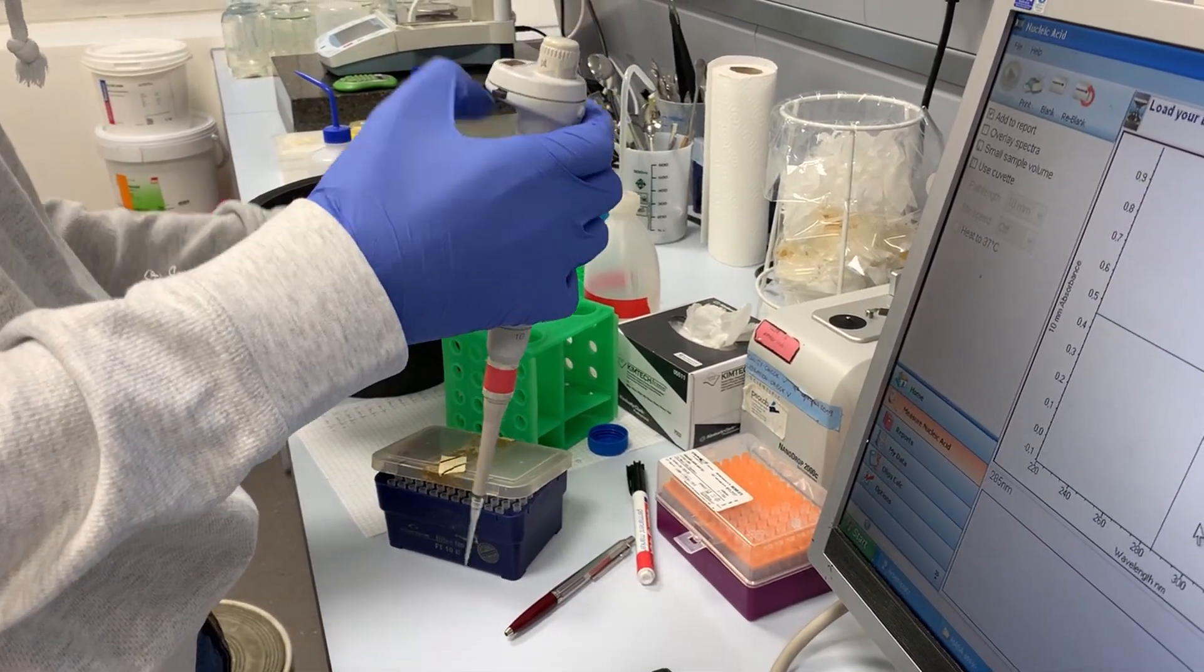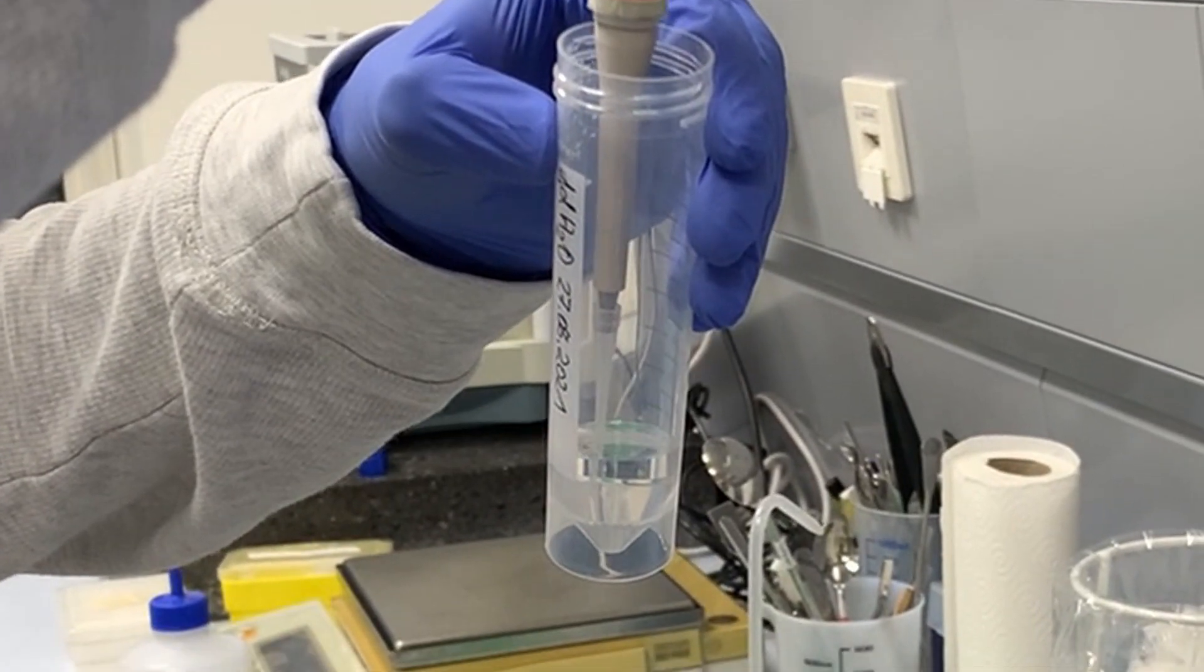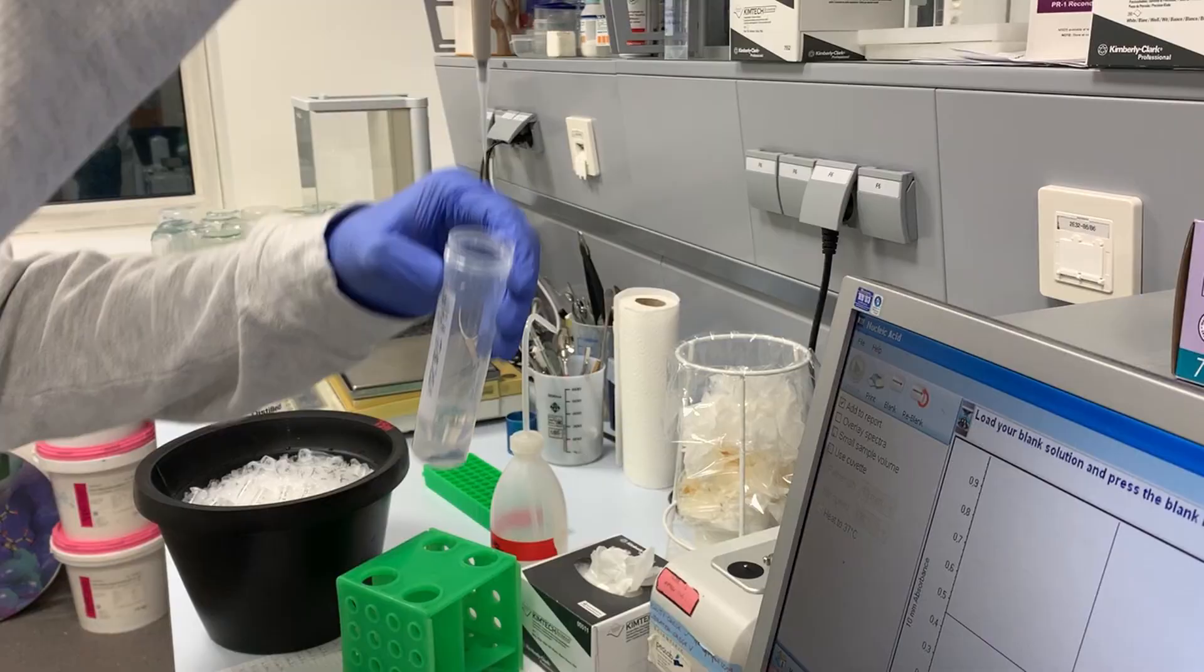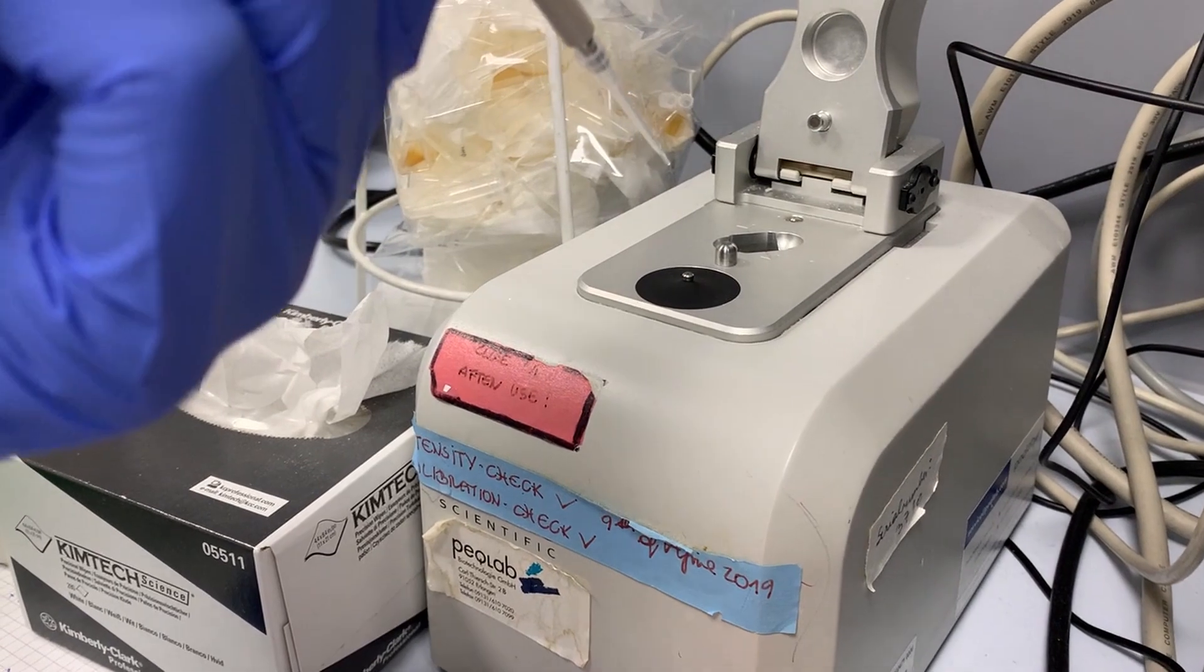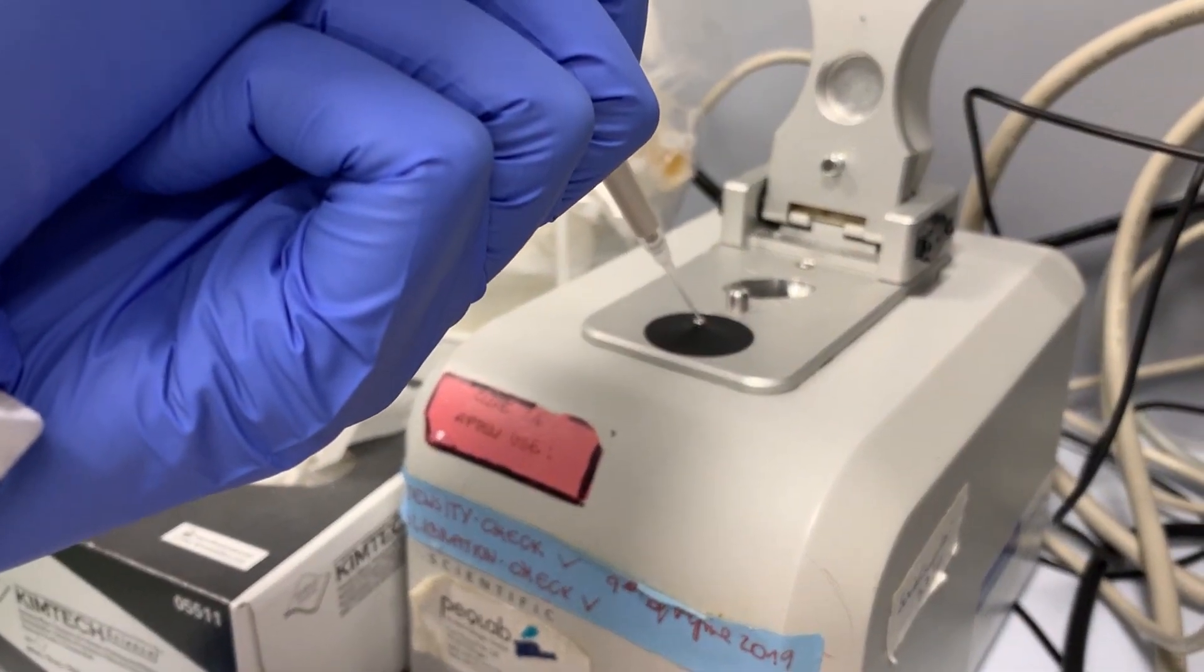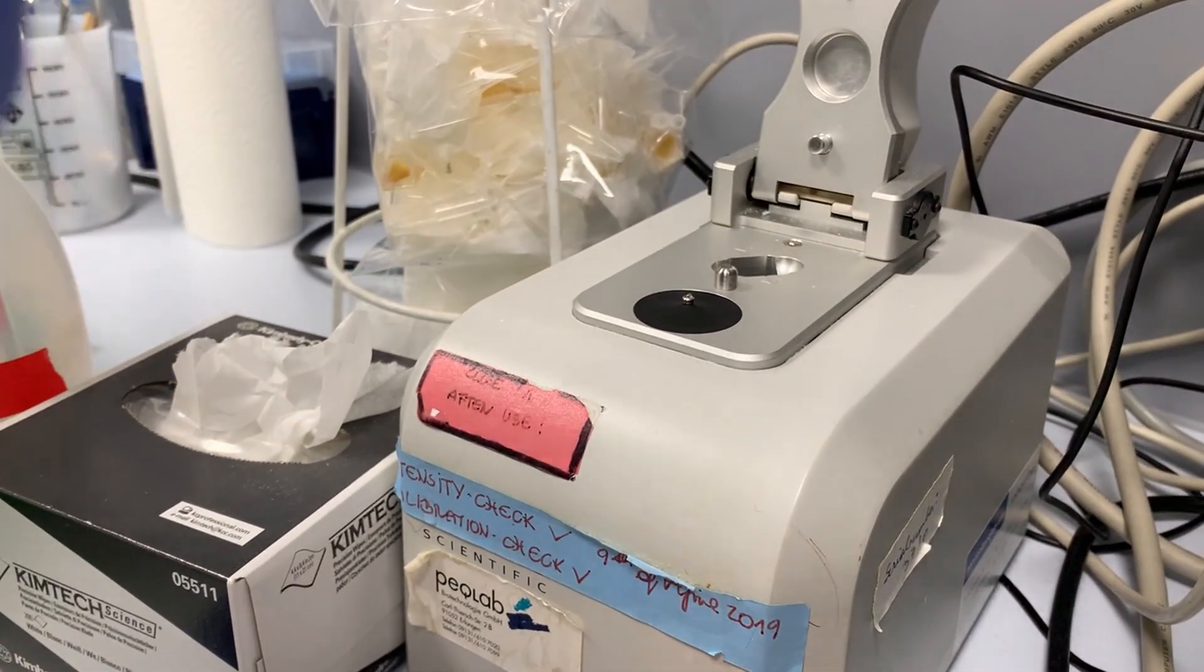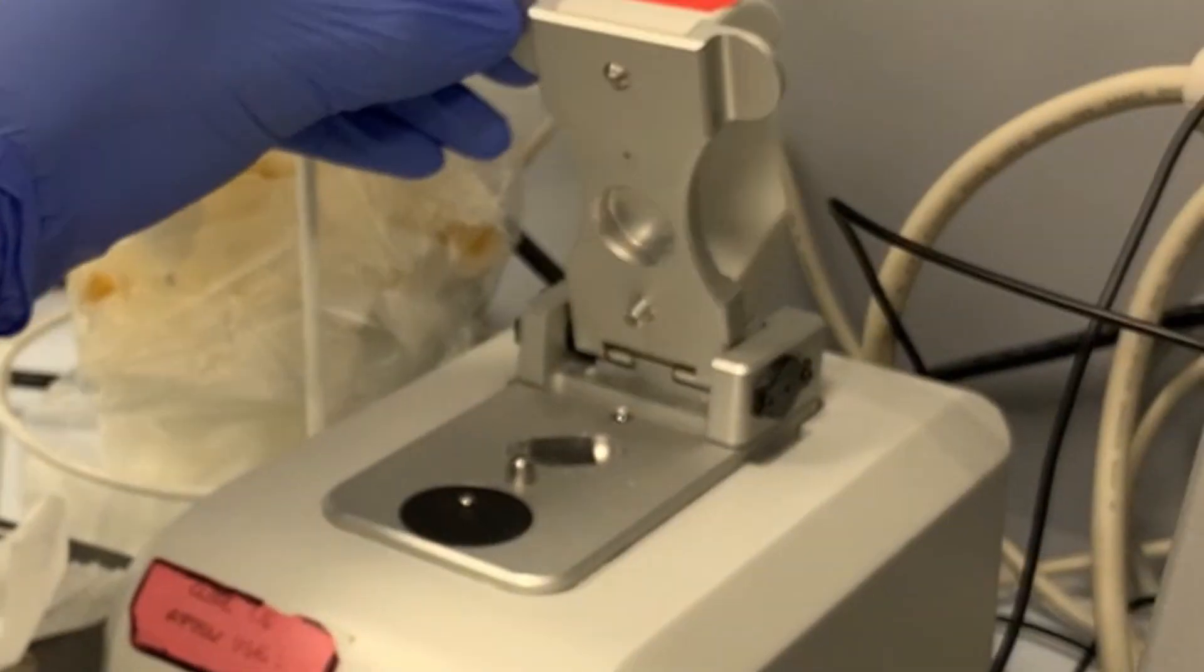You pipette one microliter of your blanking solution onto the area of measurement and try to hit the very center. Then close the lid very carefully.